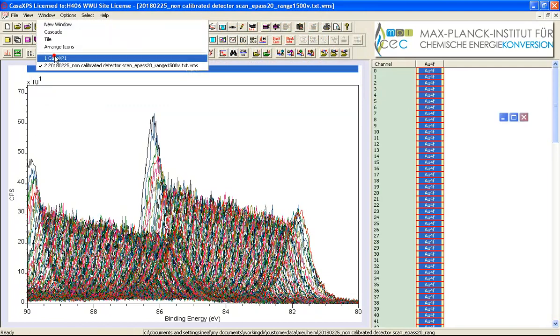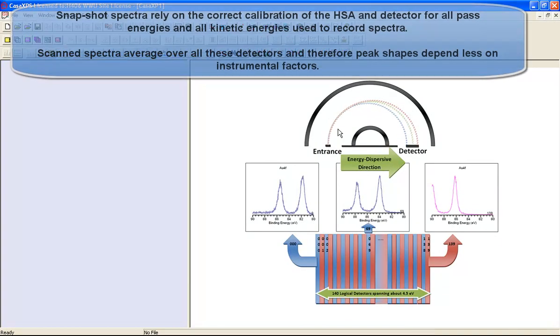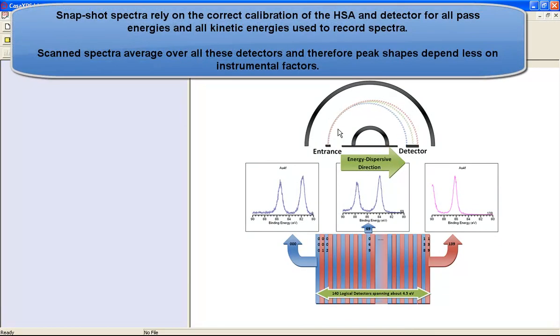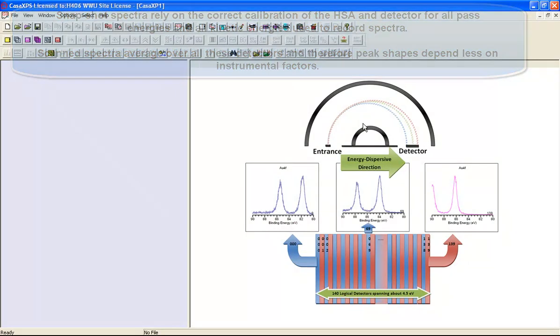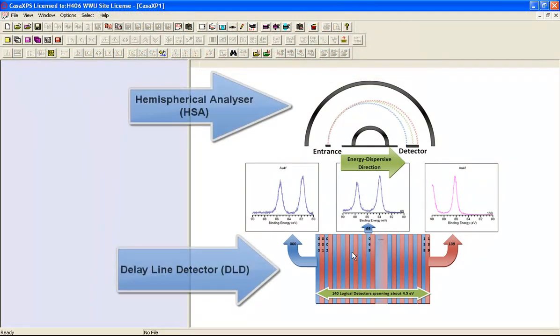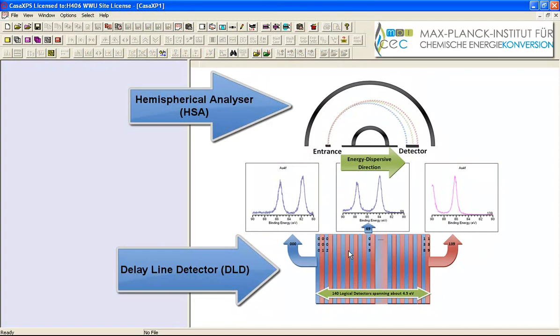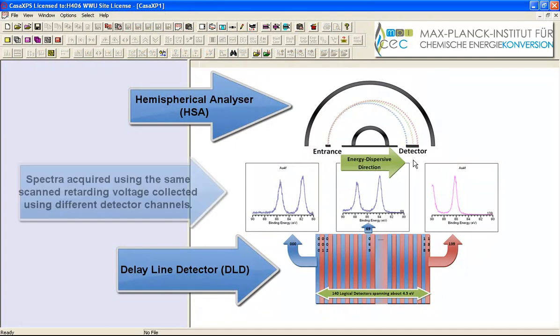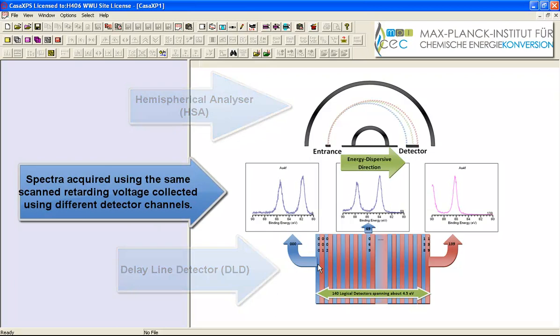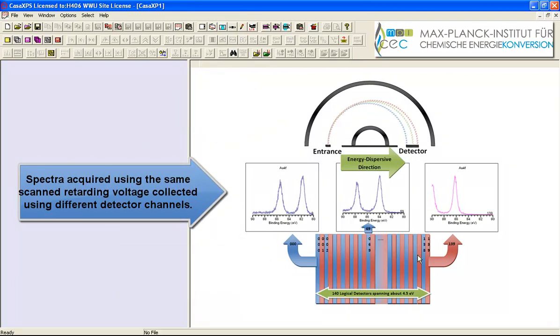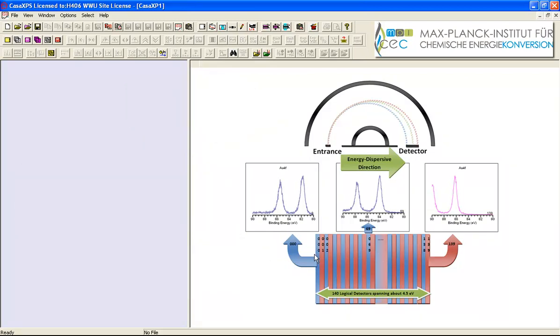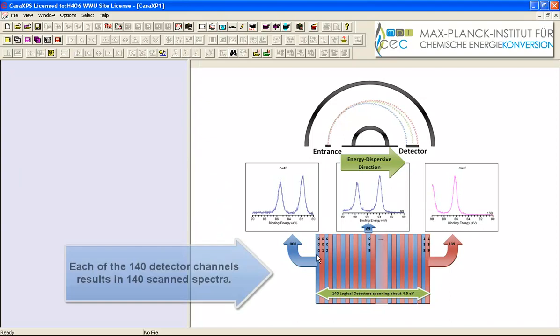So if we look at a schematic of the hemispherical analyzer we can try and understand how these data have been acquired. So we have a detector which is in this case a one dimensional detector but it can be partitioned into 140 different detector channels and from each detector channel you can acquire a distinct spectrum.